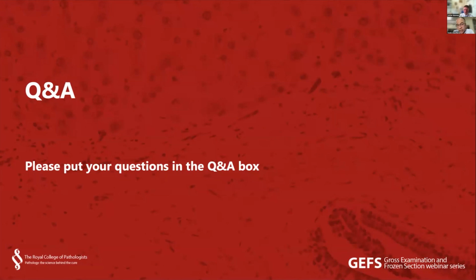Yeah, thank you. I think I have a confession to make, in a sense. I do practice GI and gynae path, but we have kind of given up looking for apical nodes. We look for all the nodes, and I think our clinical colleagues are all right with TNM classification. As you mention, they're not particularly looking for Duke's staging. But I think that's right.